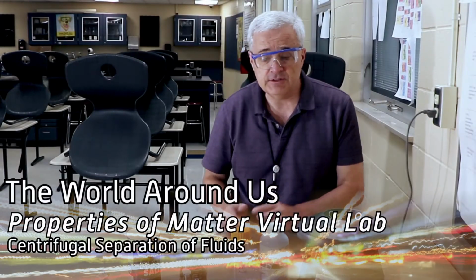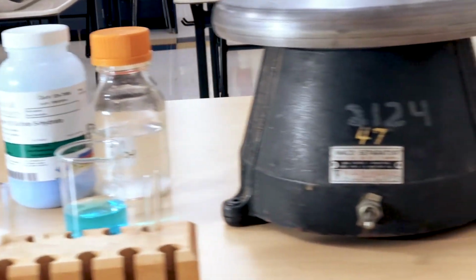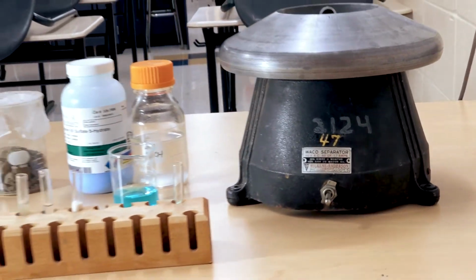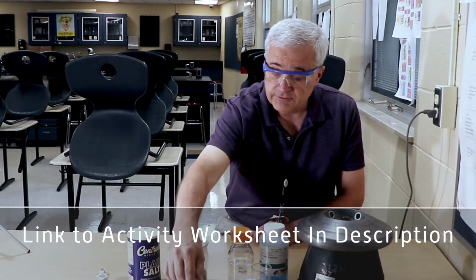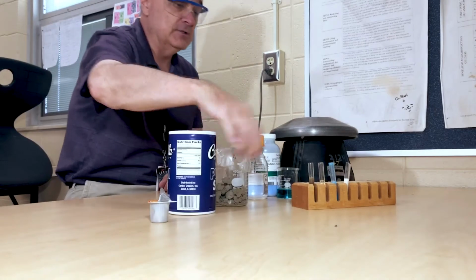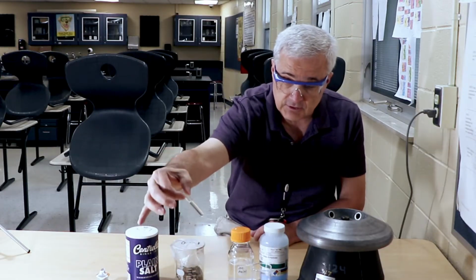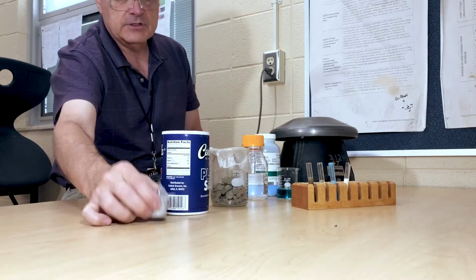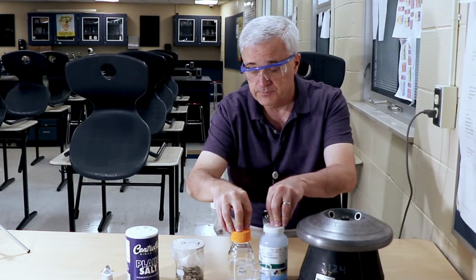Hi, I'm Bill Snodgrass, and in this lab experiment, it's an activity where we're going to use centrifugal separation to look at some fluids, some samples that we have. So we have some dirt that has been mixed into water. We have some salt that has been mixed into water. We have some coffee creamer, and then we have a mixture of.